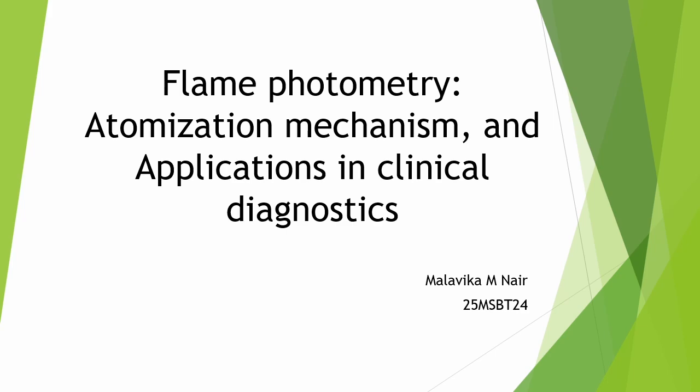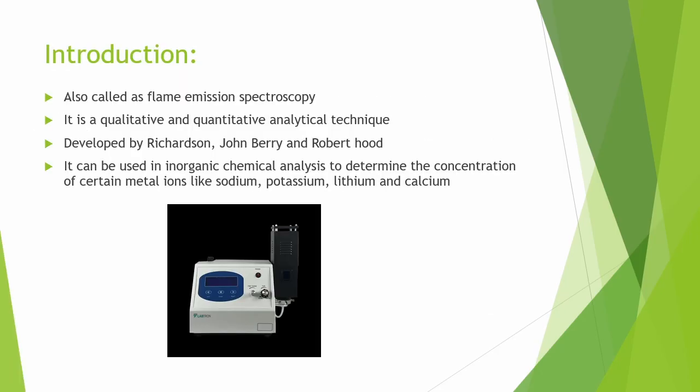So I'm Malavika and I'm here to present on the topic Flame Photometry, Atomization, Mechanism and Applications in Clinical Diagnostics. It is also called flame emission spectroscopy. It is a qualitative and quantitative analytical technique, and it was developed by Richardson, John Berry, and Robert Hood.